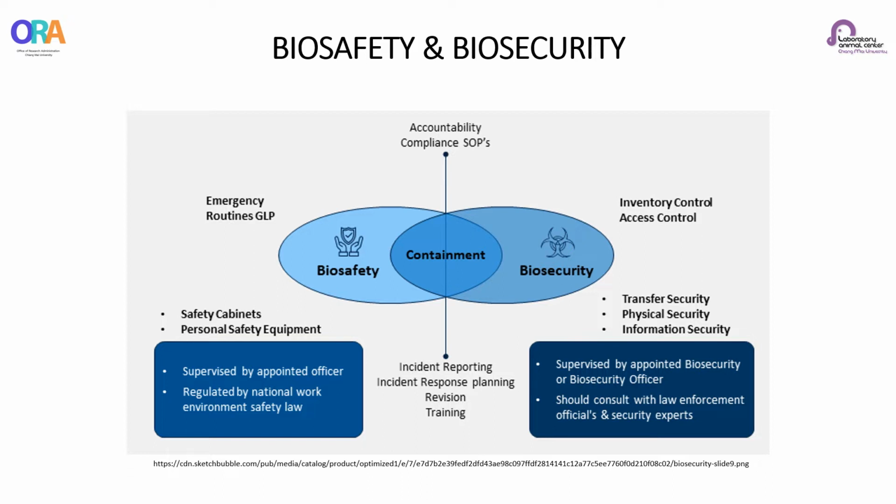For example, standard practice requires that signage be posted at the laboratory door to inform those who may enter about hazardous agents used in the laboratory. However, it may be unwise to list an agent that, if stolen, could be weaponized and used for bioterrorism. Therefore, it is important to balance the needs of both biosafety and biosecurity when developing both programs for a laboratory. Biosecurity should not jeopardize or conflict with required laboratory operations.